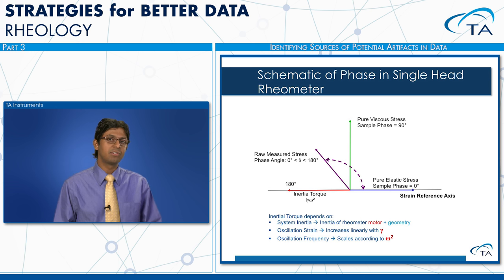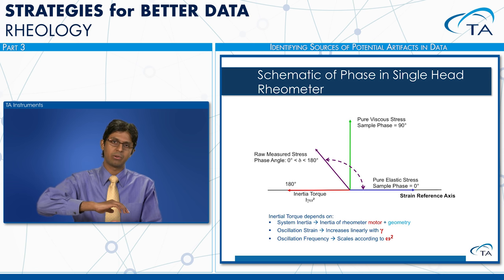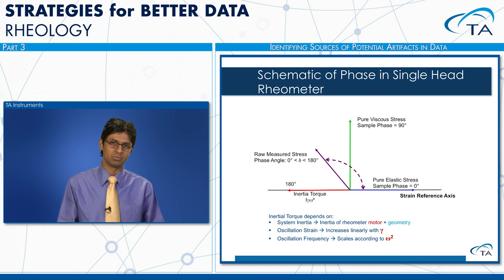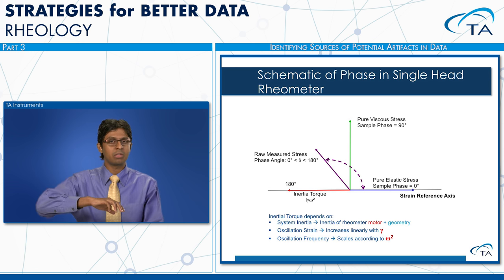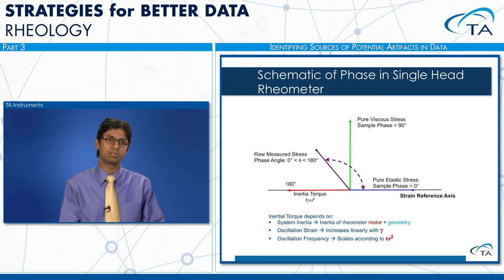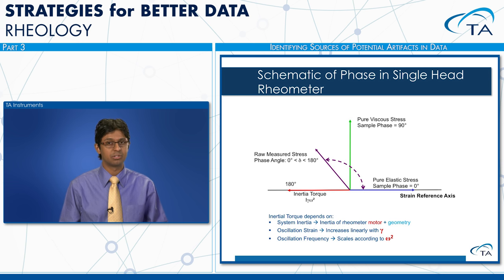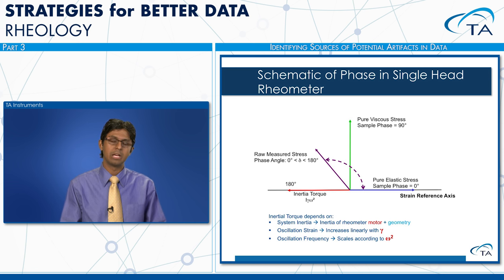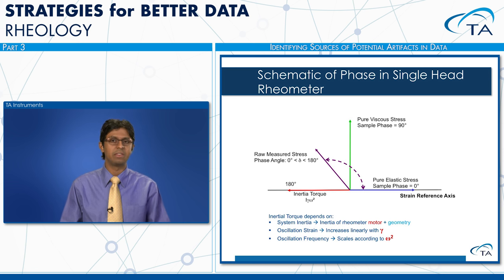With low viscosity samples at high frequencies, the torque required to accelerate the mass back and forth can become very large — that's where inertial torque comes into play. Inertial torque depends on three factors: system inertia (motor plus geometry), oscillation strain (inertial torque increases linearly with strain), and most importantly, frequency — inertial torque scales as omega squared, which is why these effects kick in at higher frequencies as seen with S60 and S3 silicone oils.